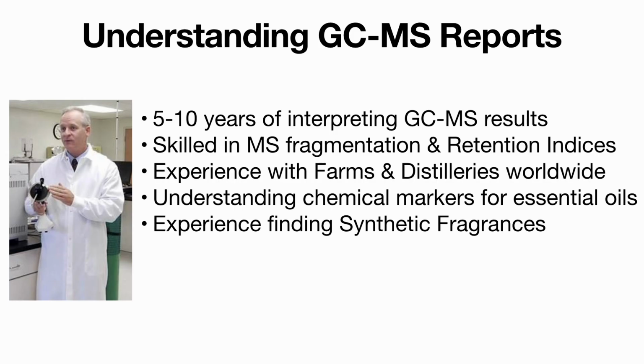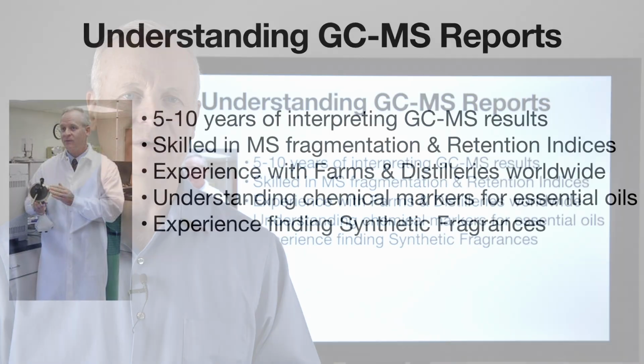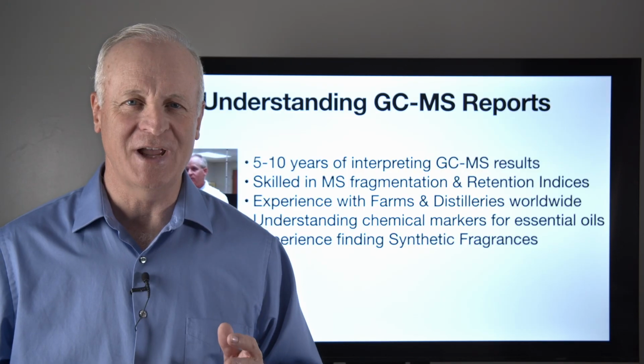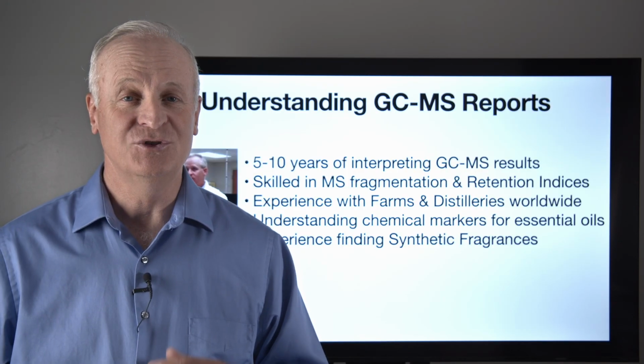Next, you have to have an understanding of the chemical markers, the components that need to be in an essential oil. If these components are all here, then the essential oil is of the highest quality. And lastly, you need to have an understanding and experience looking for synthetic fragrances, synthetic chemicals placed in essential oils.